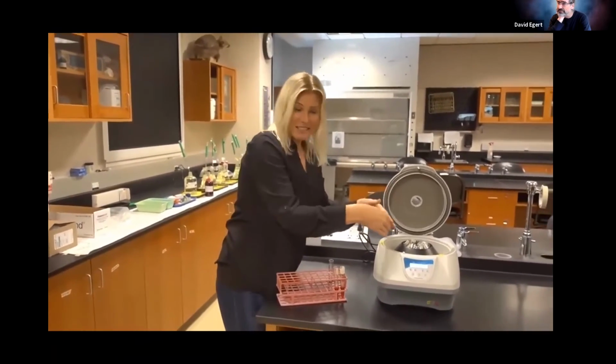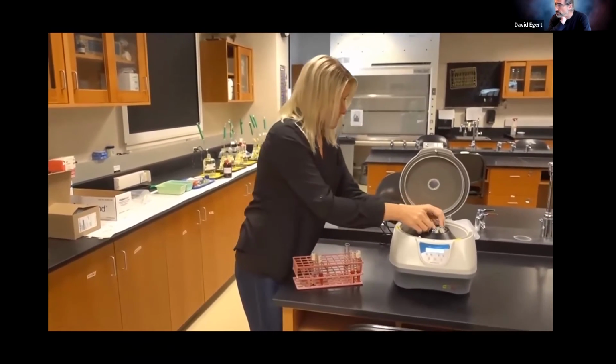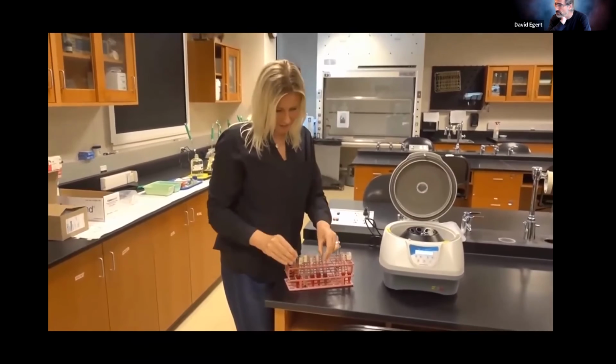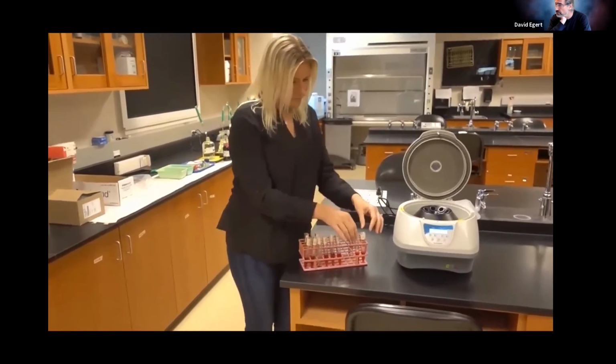So anyway, I'm just going to take these out. Since I have them numbered, I don't need to pay attention to exactly where they're at now. It's more important for me to get the next batch started, and I can rearrange these later.